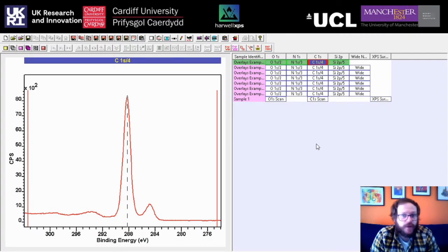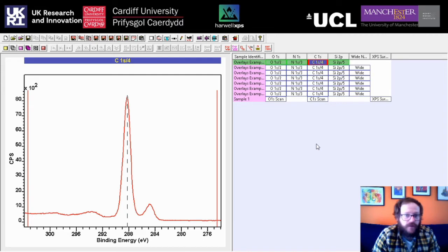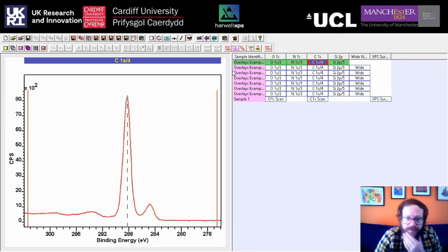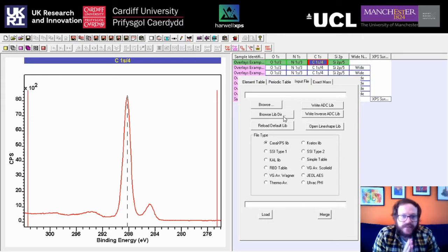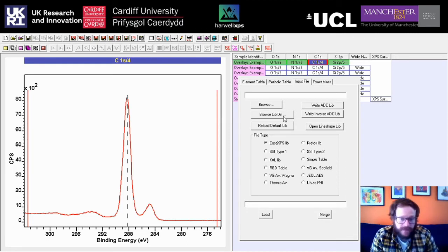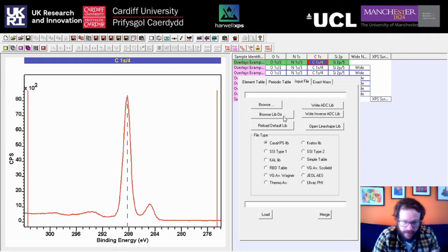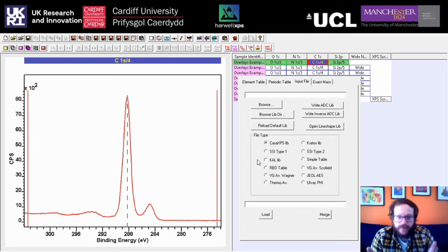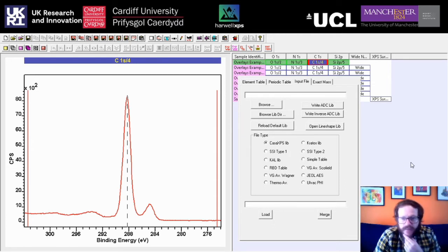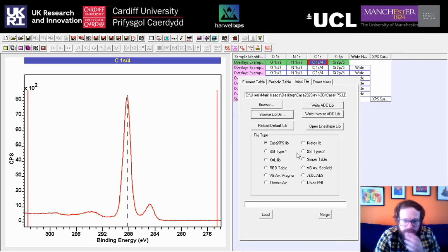Before we really get into processing, there's one last step: loading up the library file. Come over to Library (or press F10) and go to Input File, then Browse Library Directory. If you're using data from a Thermo instrument, this version of the software will load the Thermo Schofield values automatically. If you're using another instrument — for example a Kratos instrument — there's a specific Kratos library you can load by selecting it and clicking Load. Just make sure you've got the right library loaded for your data.